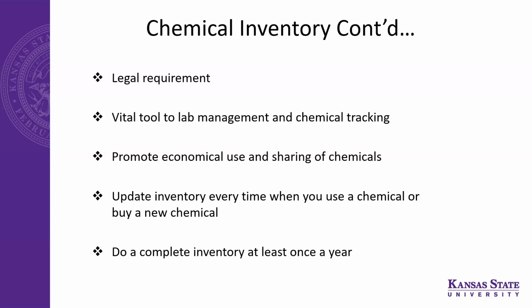And at least do a complete chemical inventory annually. You go along as things come in day by day, but still you can miss something, right? So if you at least do an annual inventory, then you can plug those gaps.